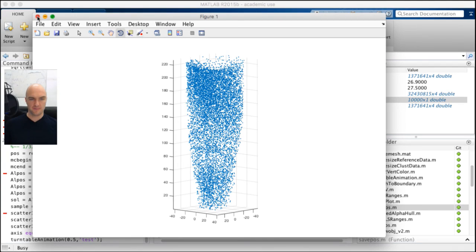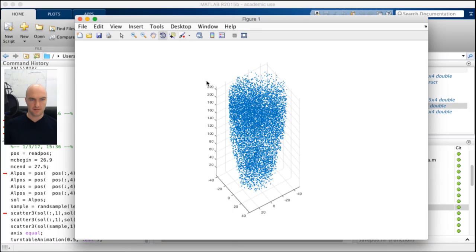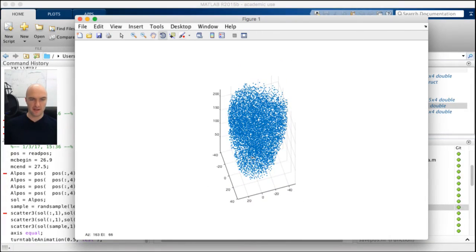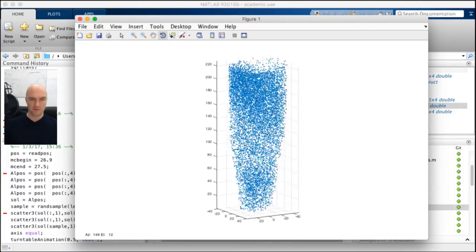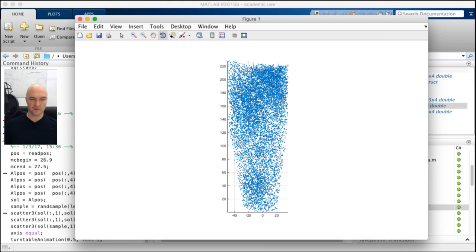Okay, done. This obviously gives you a little bit more freedom because basically, you could, for example, move it to here and have it rotate, or you can move it to here and have it rotate. So you can use whatever perspective you want, and it will just rotate starting from that perspective. Usually, a good thing to do is to use XZ view or something like that, so that you can be consistent.